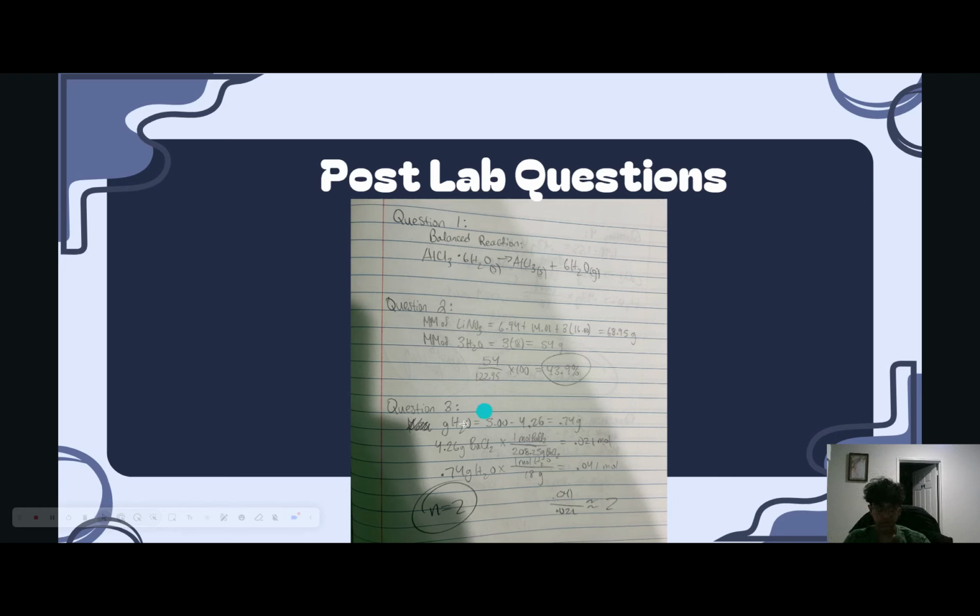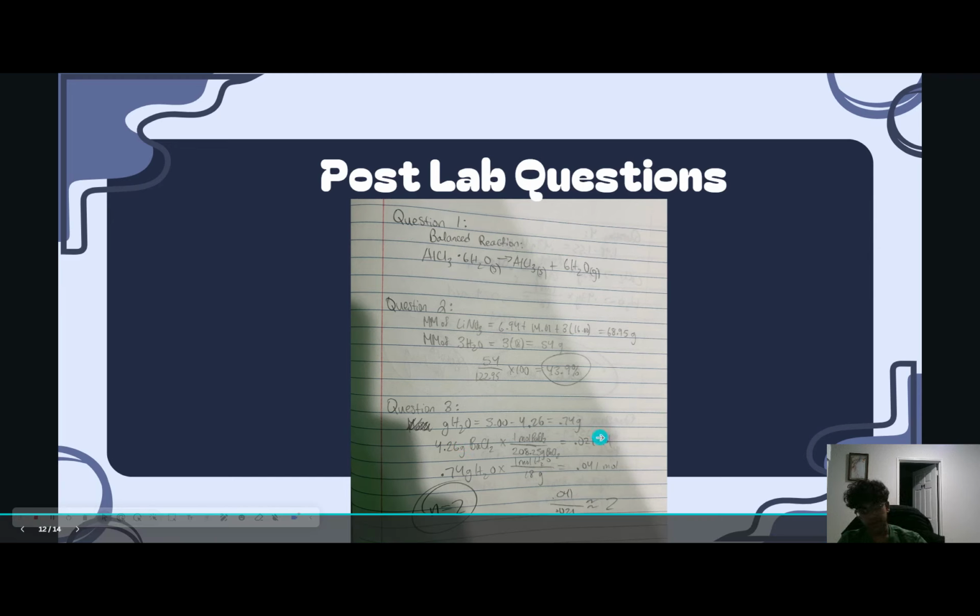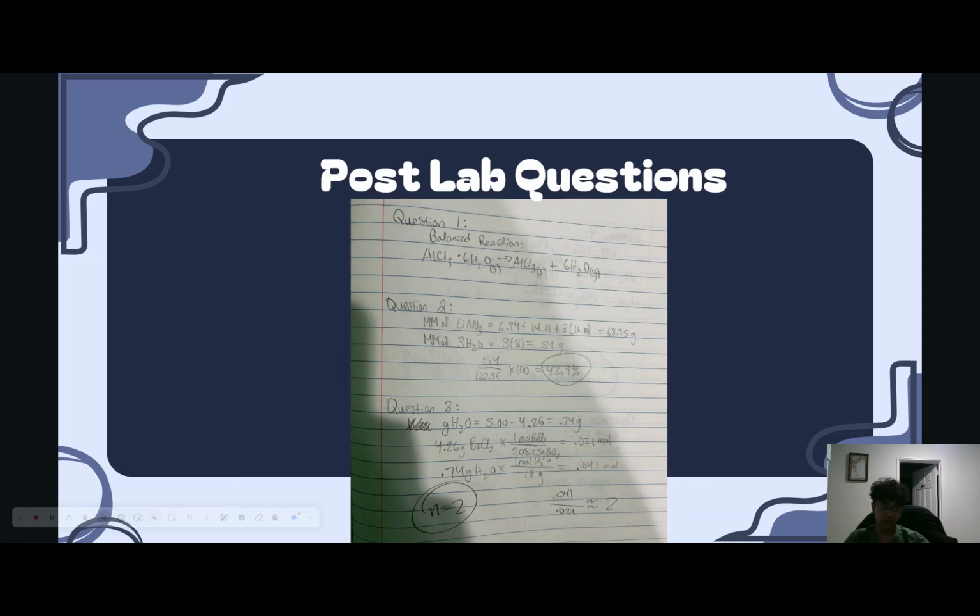And for question 3, we had to find the grams of H2O as the missing ingredient. And then what I did was dimensional analysis to find the moles of BaCl2 and H2O. And for BaCl2, it was 0.021 moles, and for H2O it was 0.041. And I put 0.041 over 0.021, which got approximately 2 for the coefficient for H2O in the hydrate.